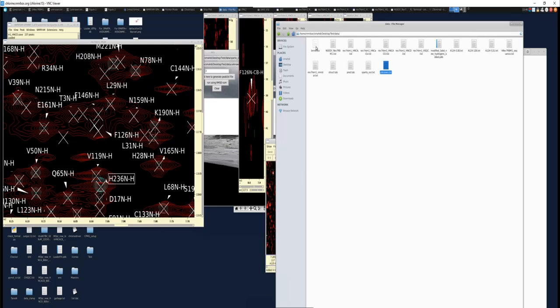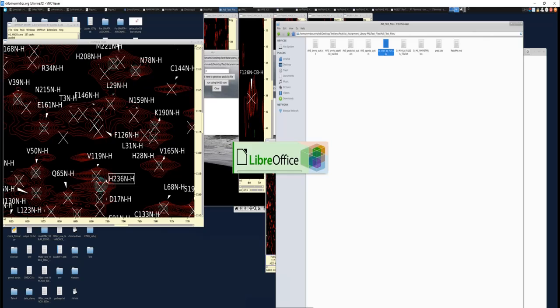So you'll notice in this PAL file, if we go into the peak list assignment library, there's this folder called test files, and you'll notice there's these AVS test files. If you open this up, there is this file called csstat_aa_full.